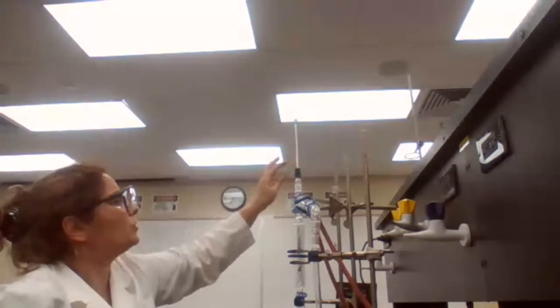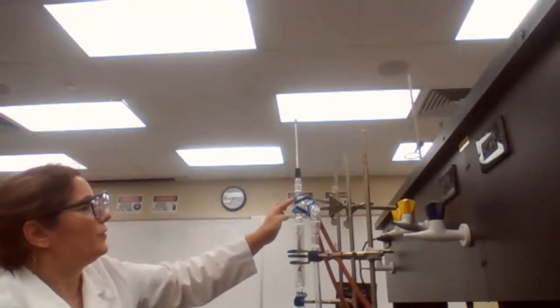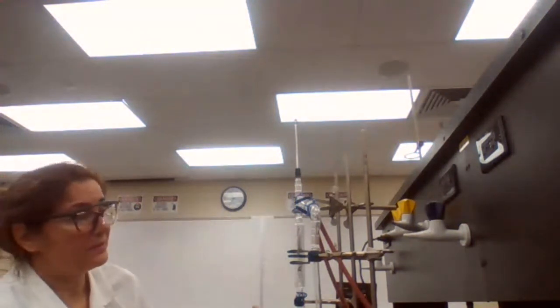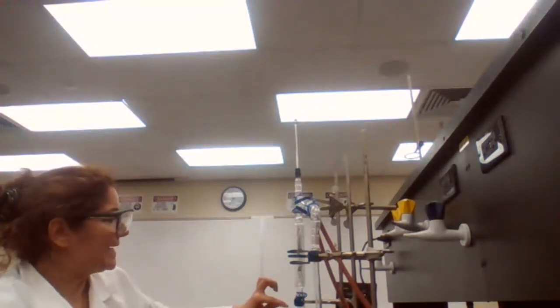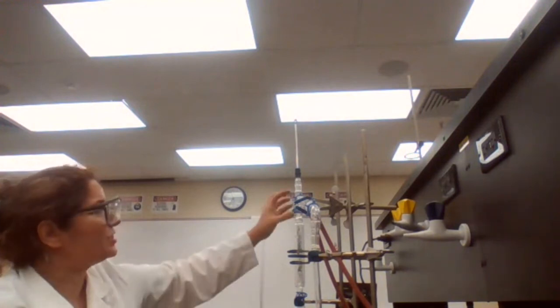So for the thermometer to show the temperature, the vapor must reach up here. When the first compound is recovered completely, the second compound is still working its way up, has not reached this ball. So the vapor is going to actually drop. It has not reached the thermometer yet. Yes, that is right. The vapor of the higher boiling point substance has not reached the thermometer yet, and that's why we get a drop in temperature.